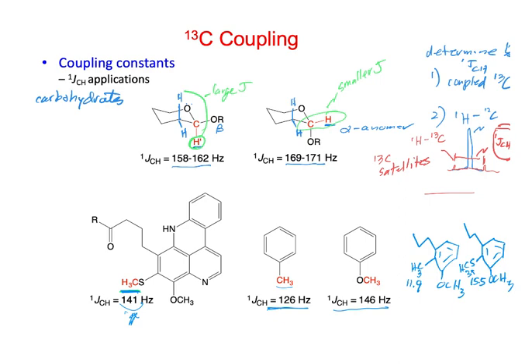I didn't understand the second one, as you said. So what type of information we got from the second one that you draw the structure right now? So what they did, I think that they actually used the C13 satellites, if I remember right, on the proton NMR.